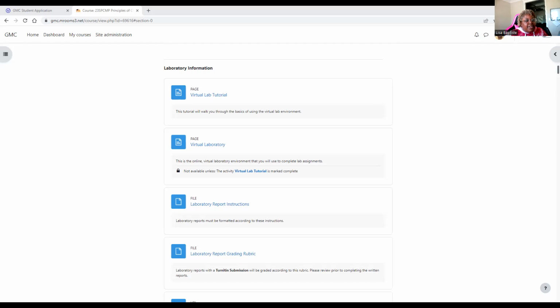And you see how it just kind of adds it in one corner, but you can click and drag it to wherever you want to place it on your workbench. You're also going to need a scale balance. So I'm going to move that out of the way. And under glassware, you're going to need this weighing boat. Okay. All right.